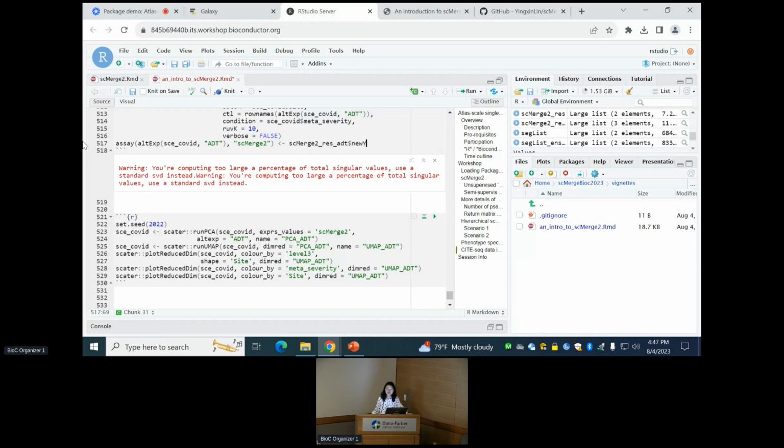Do you have a strategy to iterate and suggest to the user how to do it, manually or not? Usually, if the replicates are estimated perfectly, this number will be quite robust as a default. It's 20, so after this, it won't have a huge impact on the normalization.